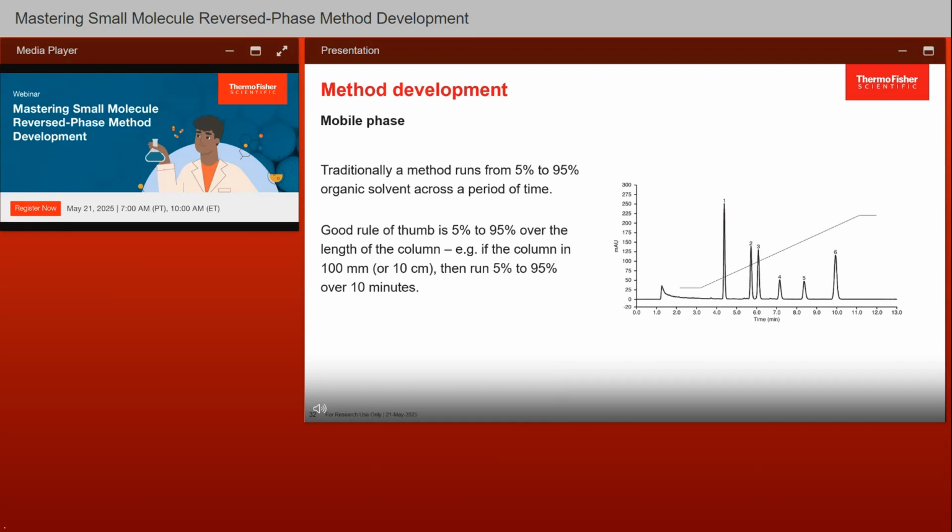The simplest method in chromatography is isocratic separation, and that's because the mobile phase composition remains constant throughout the analysis of our sample. However, switching from isocratic to gradient method offers advantages in separating complex mixtures and can improve the resolution, increase the analysis speed, and sharpen the peak shape of our analyte. Gradient method provides better control over the separation of compounds depending on the strength of the organic mobile phase and also the steepness of the gradient.